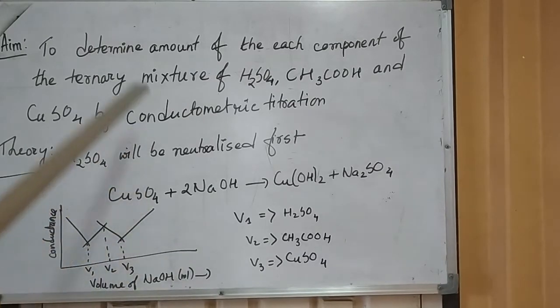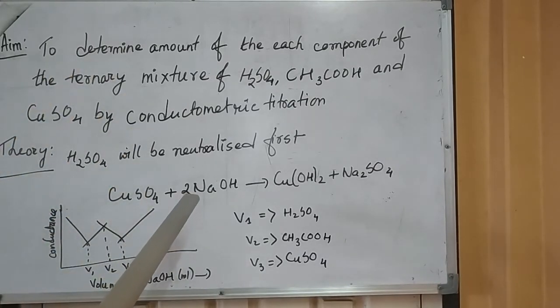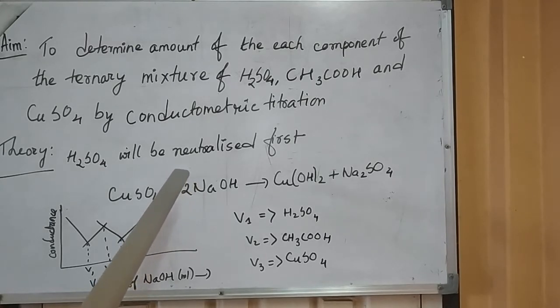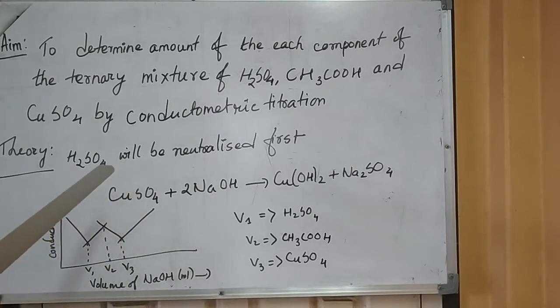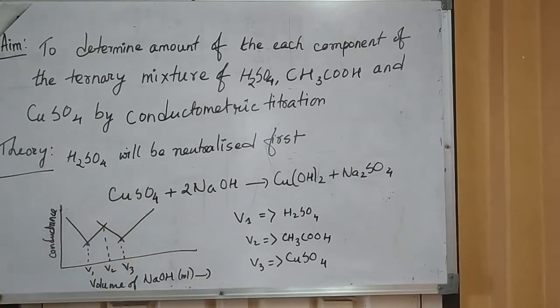For this experiment, we need a conductometric bridge, a conductometric cell, a burette, standard sodium hydroxide, sulfuric acid, copper sulfate solution, and acetic acid.